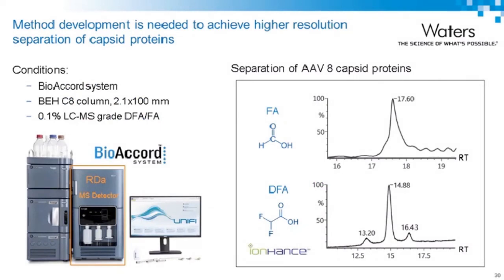Our next step was to develop the RPLC-MS method for high-resolution separation of capsid proteins. Starting on the BioAccord system with a BEH C4 column (industry standard), using formic acid as mobile phase modifier gave poor separation with a bumpy baseline from residual surfactant. Switching to LC-MS grade DFA (difluoroacetic acid) increased resolution across the proteins, flattened the baseline (indicating surfactant is separated from protein), and produced sharper peaks suggesting potential improvement in MS signal quality.